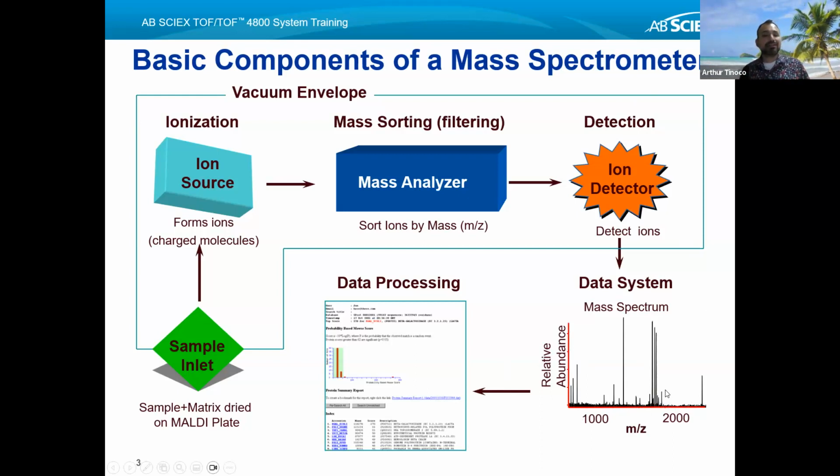Depending on the type of data you're collecting or the type of experiment you're performing, you may need to do additional processing of this data and subject it to a database in order to analyze your sample. What you're going to see tomorrow is the use of the instrument to detect some simple samples, and you don't have to do much processing at all.